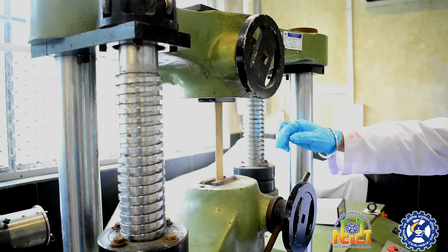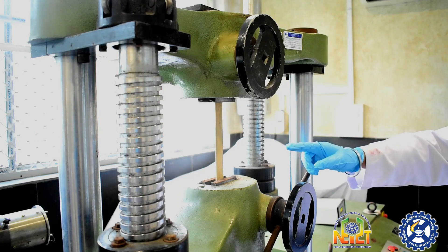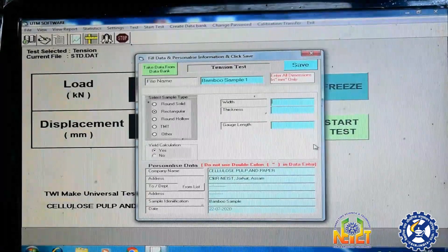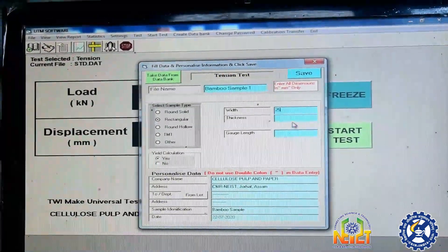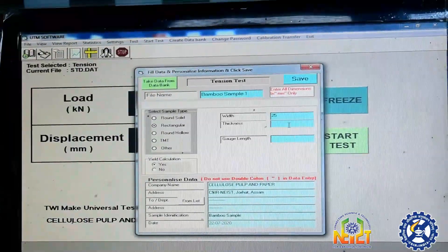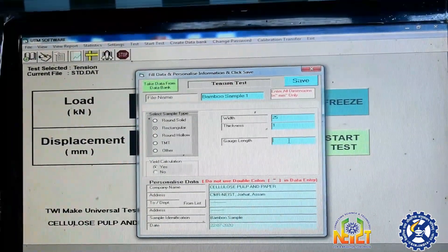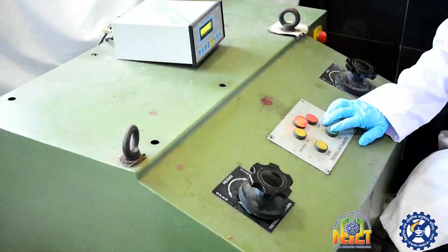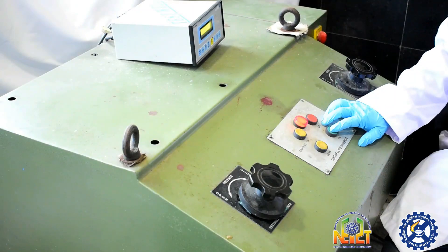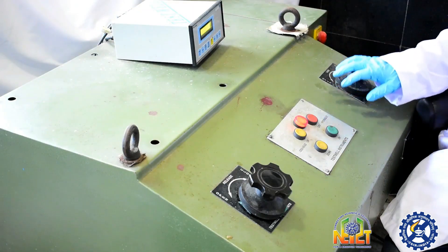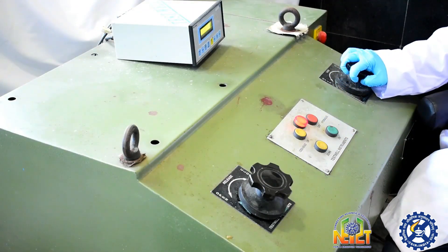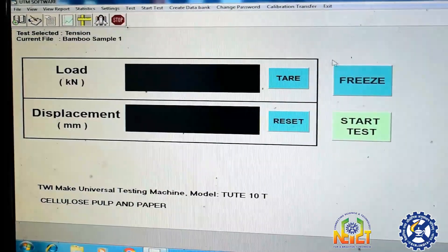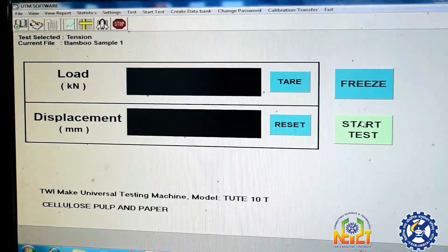This is the clamp jaw. I have fixed the bamboo strip in the jaw. Now, incorporating the respective data of the bamboo strip like width, thickness and gauge length. The instrument now releases the load in the hydraulic control panel.